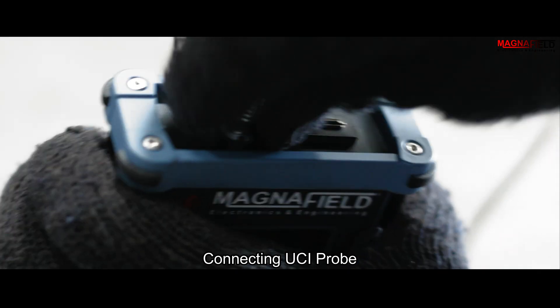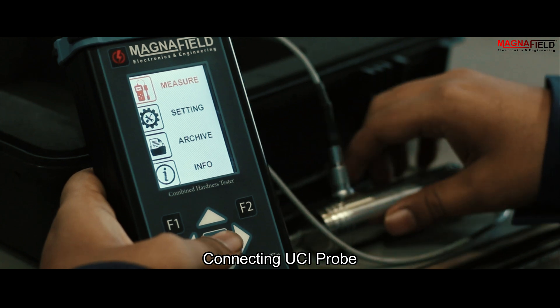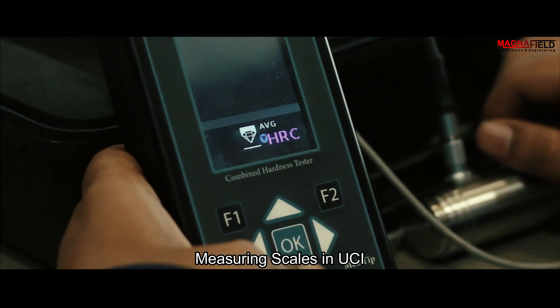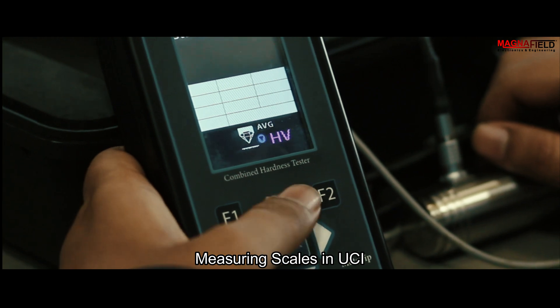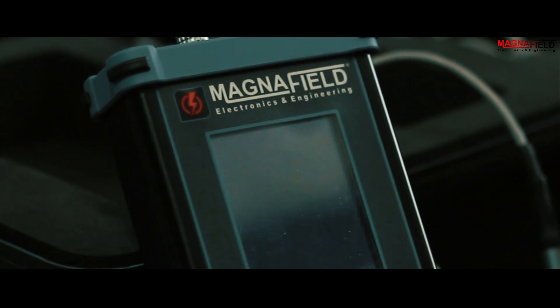Connecting UCI probe. In UCI mode, it can measure in HV, HRC, HB, and HRB. You can choose from the pre-calibrated materials provided or add and calibrate your own metal.